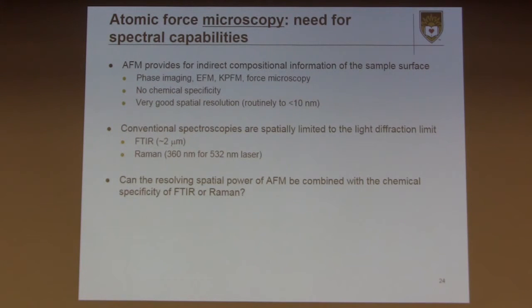Israel, I'm going to ask you, so what can AFM do for you? It's difficult, right? Because one thing is AFM is just imaging, very good resolution imaging. But Israel has a huge lab that is built on optical microscopy, which is resolution limited. Can we combine those two things? In my last slide, I'm going to show that yes, we can.